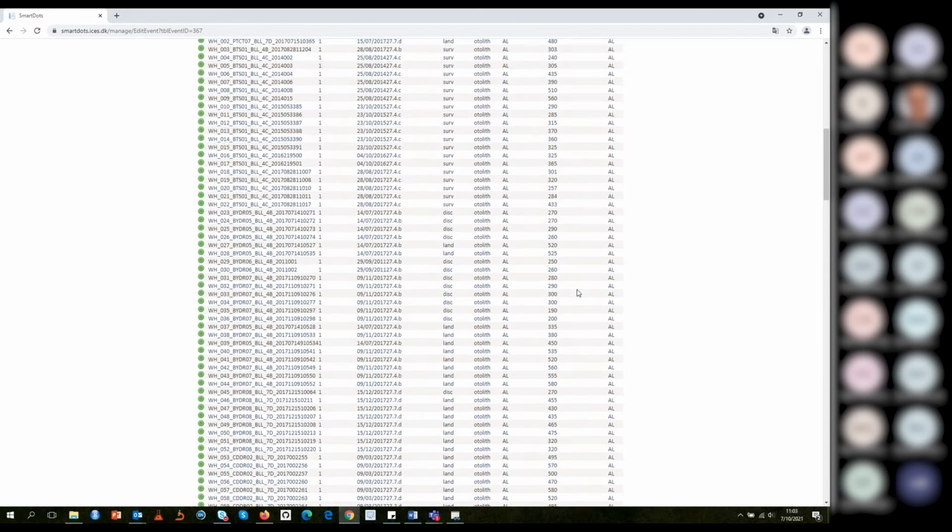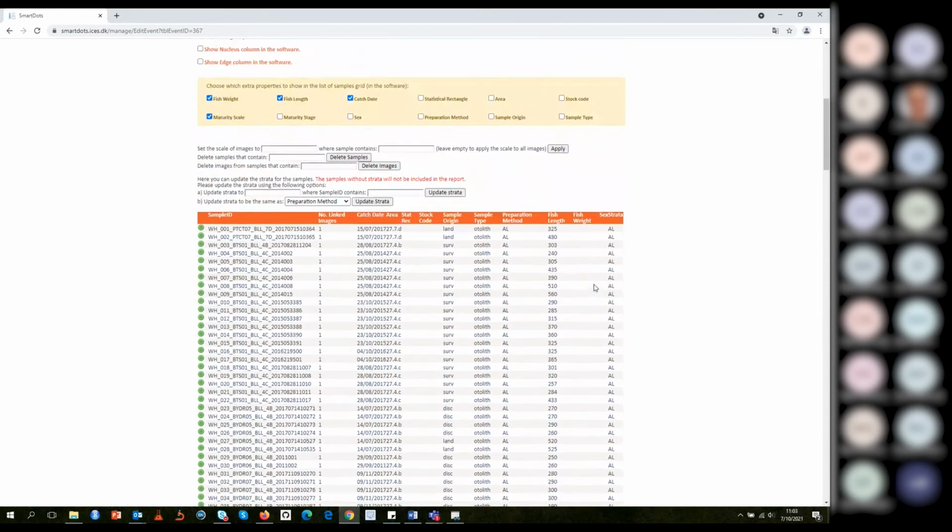So if you do this, it won't work because the two preparation methods were from the same fish. So if you would have, for example, the whole otoliths from a certain fish and the section and stained otoliths for other fishes, then it would work. It would also work if the preparation methods are from the same fish, but the readers only annotate one preparation method.